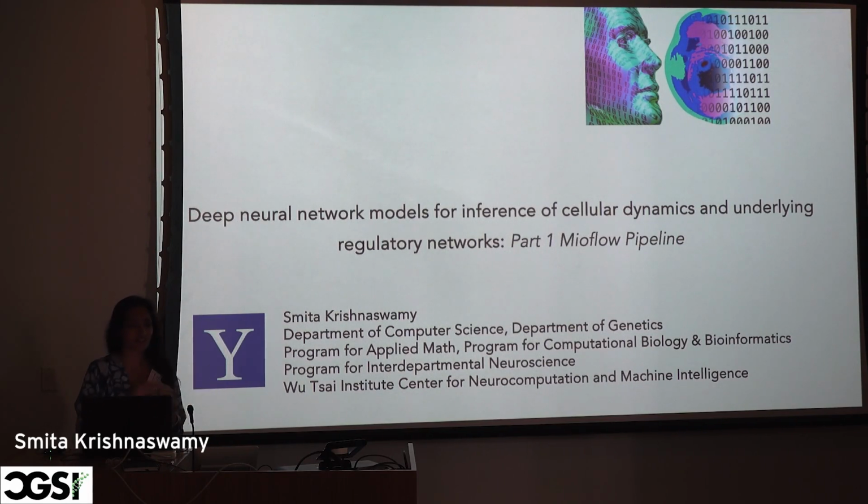This year, Eleazar and company kindly let us do this two-part tutorial, which I would say is maybe the first edition given here. Other people in Australia and other places have asked us to deliver a similar one. So this is really trying to teach you guys how to run a cellular dynamics inference pipeline on top of single cell data to derive cellular dynamics information rather than the static information that a lot of the standard pipelines derive for you. I'm pretty sure you guys are aware of Seurat and ScanPy.